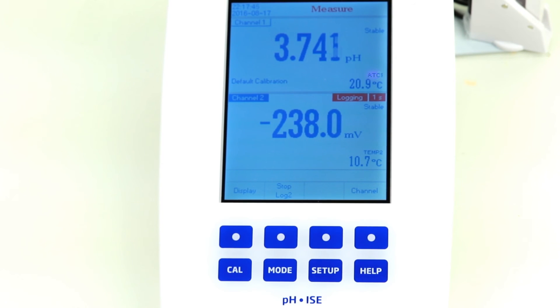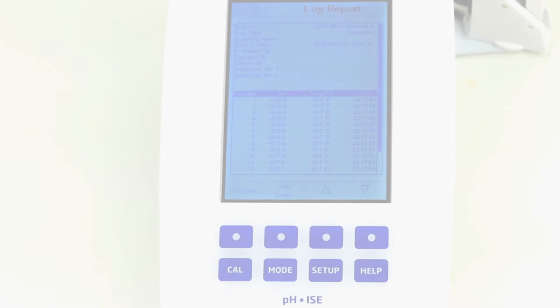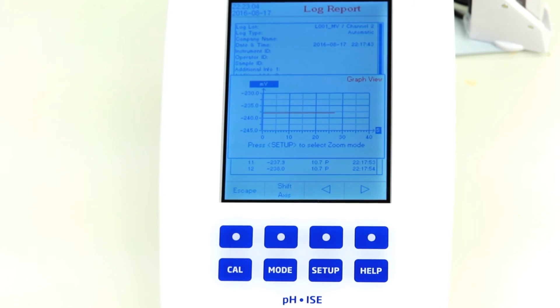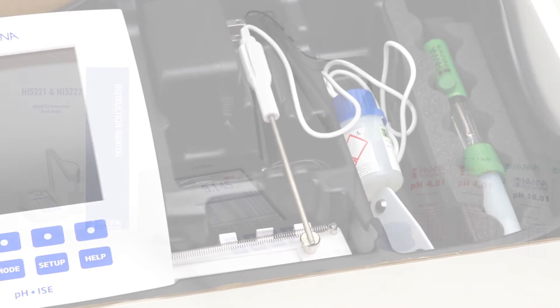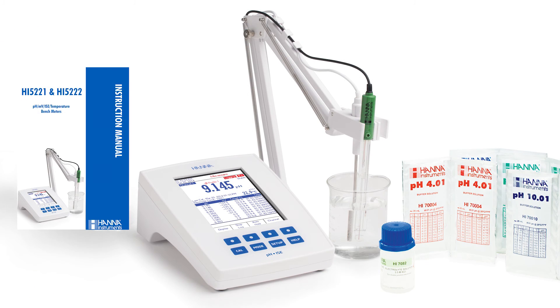Automatic logging allows you to record values at fixed intervals. The integrated graphing feature on the meter makes tracking trends easy. When you purchase the HANA HI5222 dual-channel benchtop meter, it is supplied with everything you need to begin testing pH.